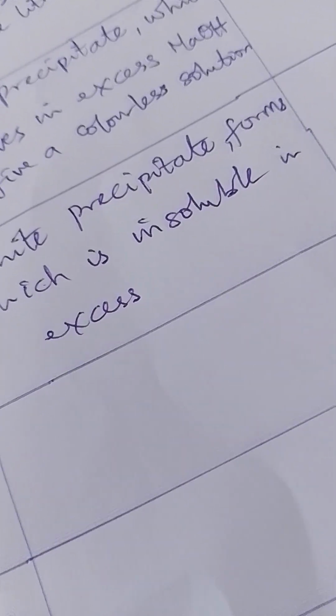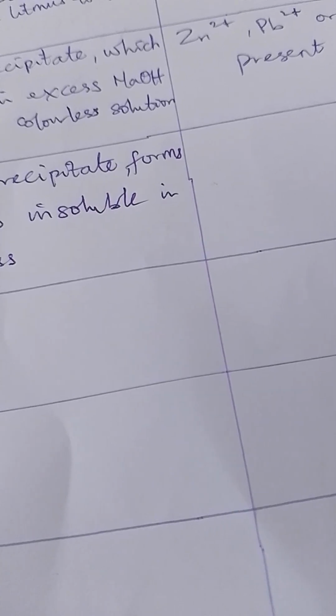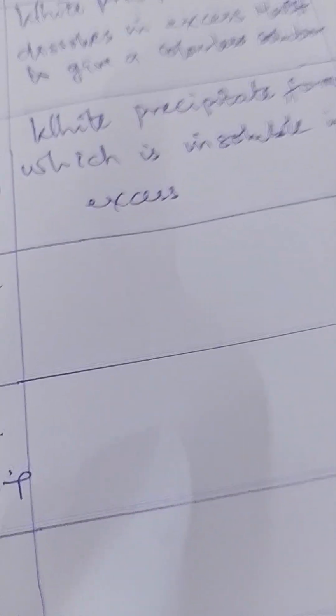All right, and when you do this, the ones out of these three that can be insoluble in excess will be what? Lead and aluminium. Zinc will not be insoluble, so zinc is out of it. So under our inference, we put lead 2 plus or aluminium 3 plus present because of the nature of being insoluble.